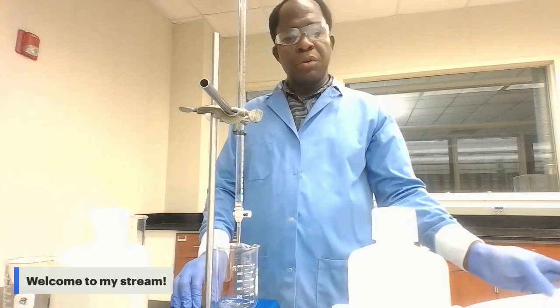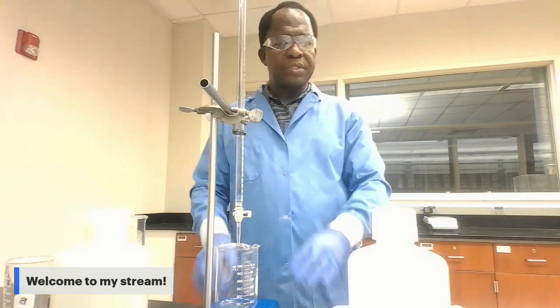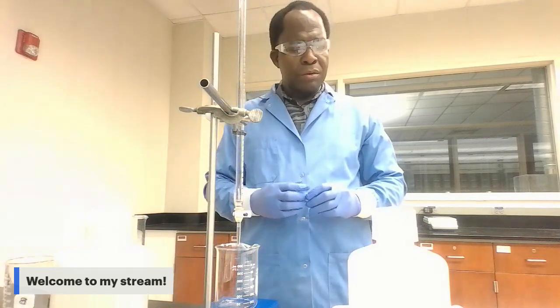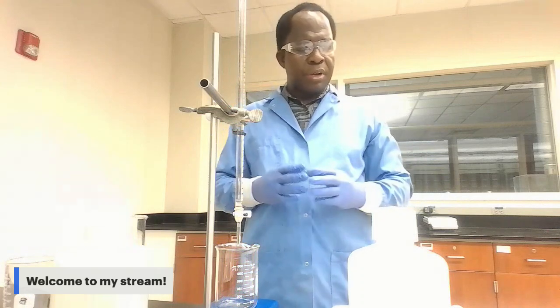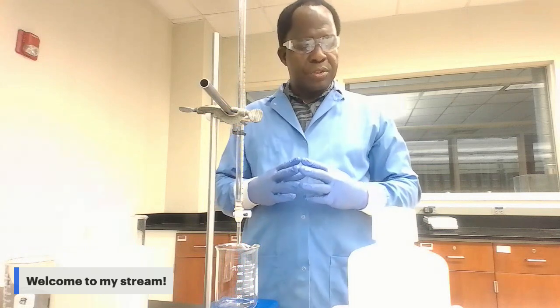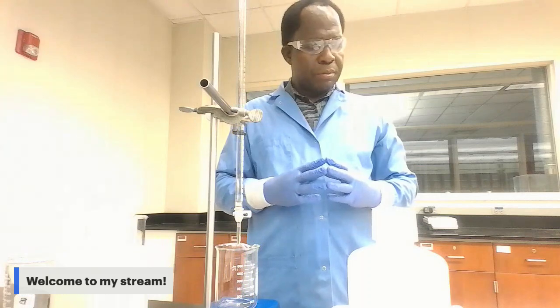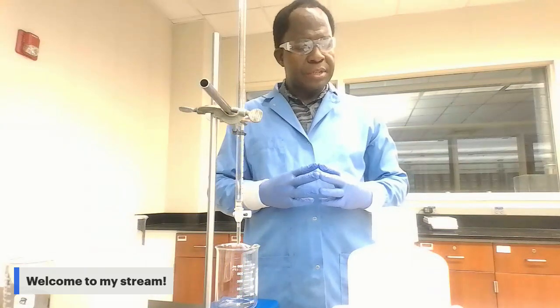So what is the purpose of this lab? In this lab, you're going to do a simple acid-base titration of a saturated solution of calcium hydroxide.